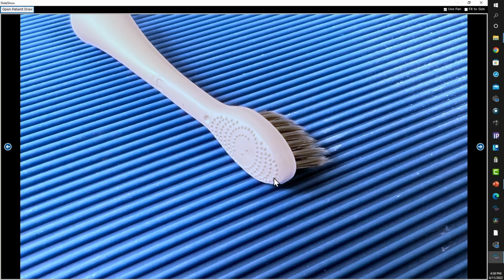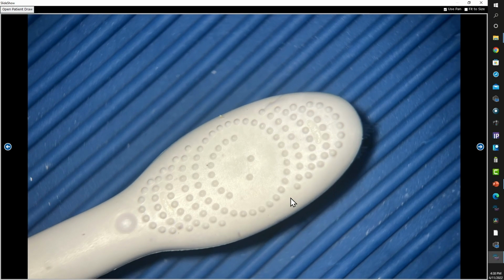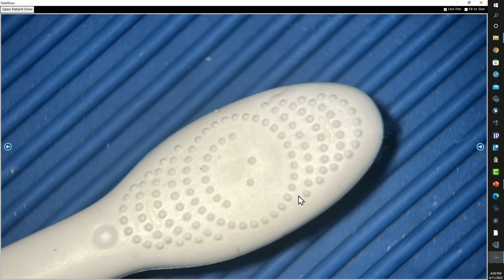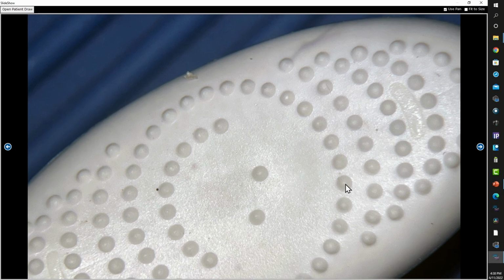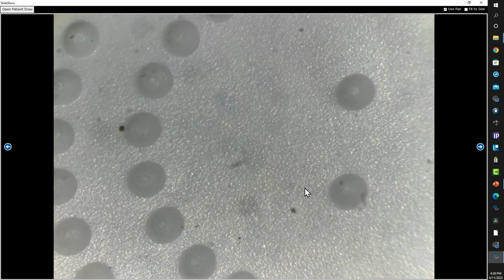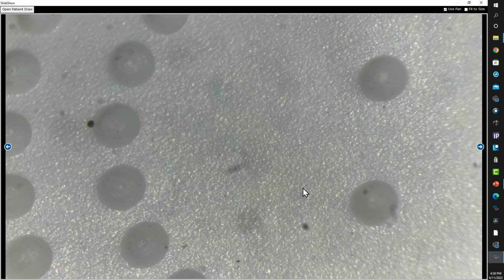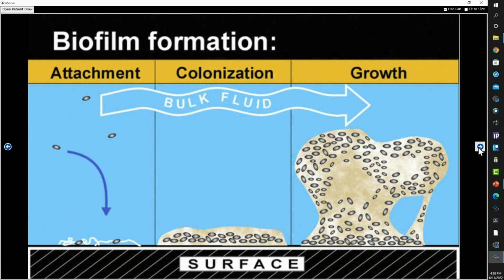There are biofilms that form on toothbrushes. For example, on this toothbrush, which is a Burst toothbrush, you have the bristle side, and then you have a side that is designed as a tongue scraper, and you scrape this against your tongue 5 or 6 times every time you brush, and it can clean the bacteria off of the tongue. So for sure there'll be a biofilm attached to all toothbrushes, and so we decided to take a look at 4 or 5 different brushes.